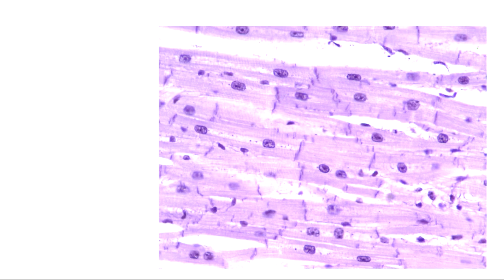We can see the nuclei, because remember, it's multinucleate, and you see those long, skinny cells. And then we get to our much more messy cardiac muscle tissue with the intercalated discs that attach the cells there, and still those stripes, really big nuclei, or are ones where we can see those intercalated discs really clearly. So those are our two types of striated muscle tissue.